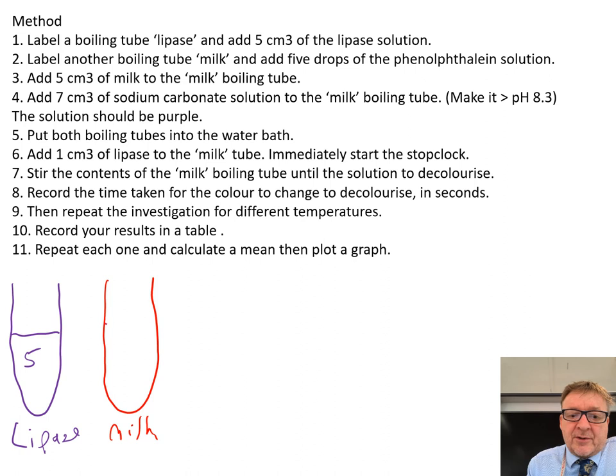Add 5 cm³ of milk to the milk boiling tube, then add 7 cm³ of sodium carbonate solution. When the phenolphthalein is added with the sodium carbonate, the solution should go purple.